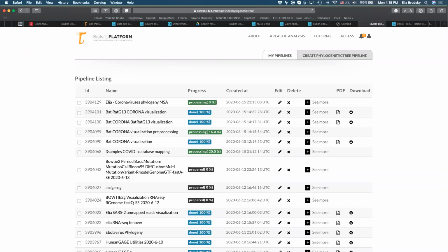So that's why we wanted to do this again, so that everyone has a chance to practically start it on your own account, to then be able to track the output. So did anyone else start this pipeline? Okay, let me know if you were not able to do it. I can repeat this again just to make sure that you do start it.